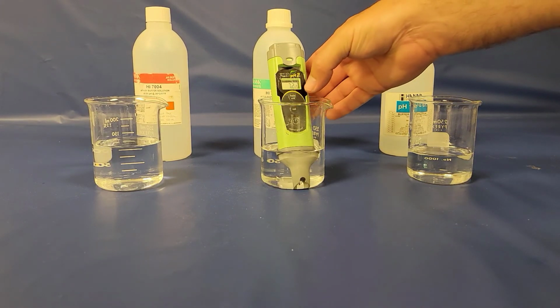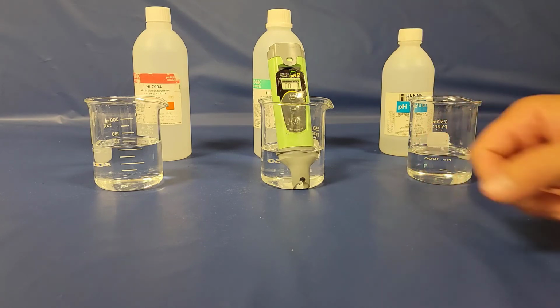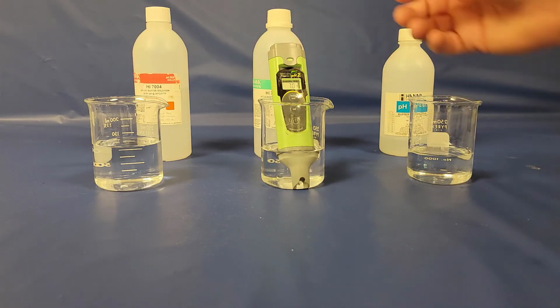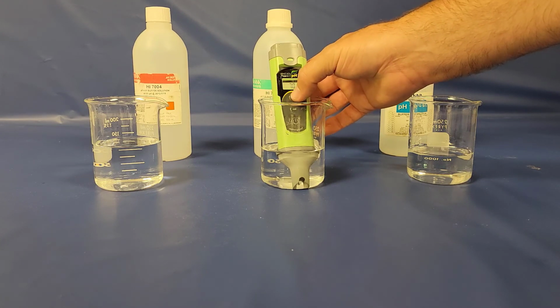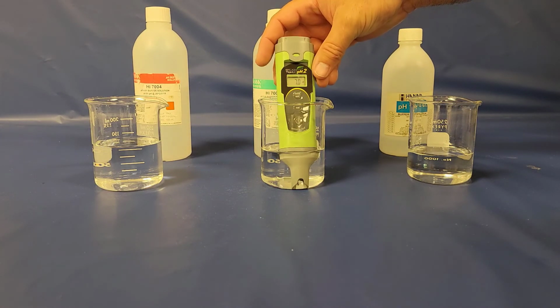You might not be able to tell, but there's a calibration button here I'm going to hit. And then it's going to flash cal there, basically saying that it's calibrated. So now it's saying here's what the reading is. We're doing the 7 calibration. So I'm going to go ahead and hit enter, and it's going to calibrate to a pH of 7. So that particular unit is calibrated.